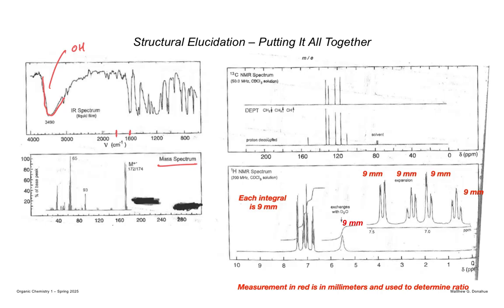And then what can you see with your binoculars about the ratio of those signals? So it's 1-to-1. So trust me, even though it might not be resolved, those two signals are 1-to-1. So that tells you there's got to be a bromine.